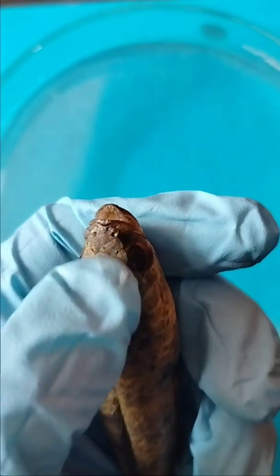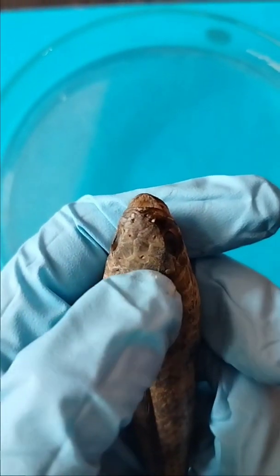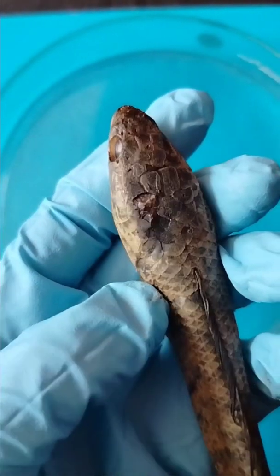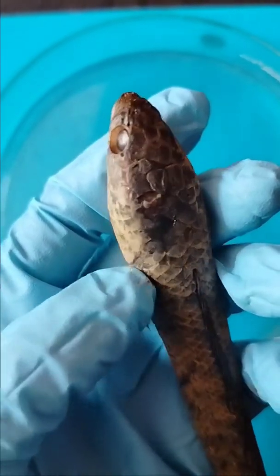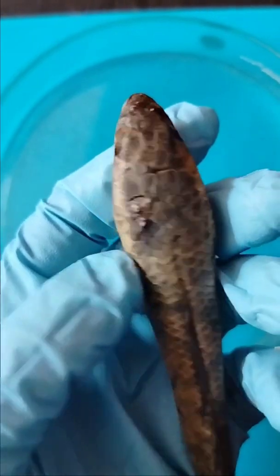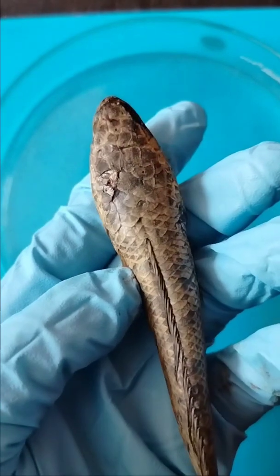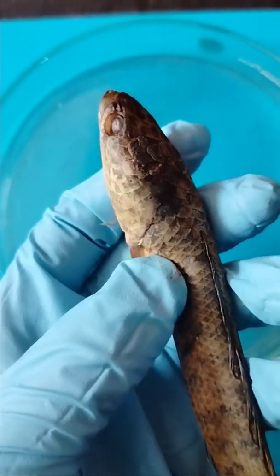Its scientific name is Channa marulius, and commonly it is called snake-headed fish because the head of the fish looks like a snake. That is why it is commonly called snakehead fish. I am using this specimen today for my practical work.